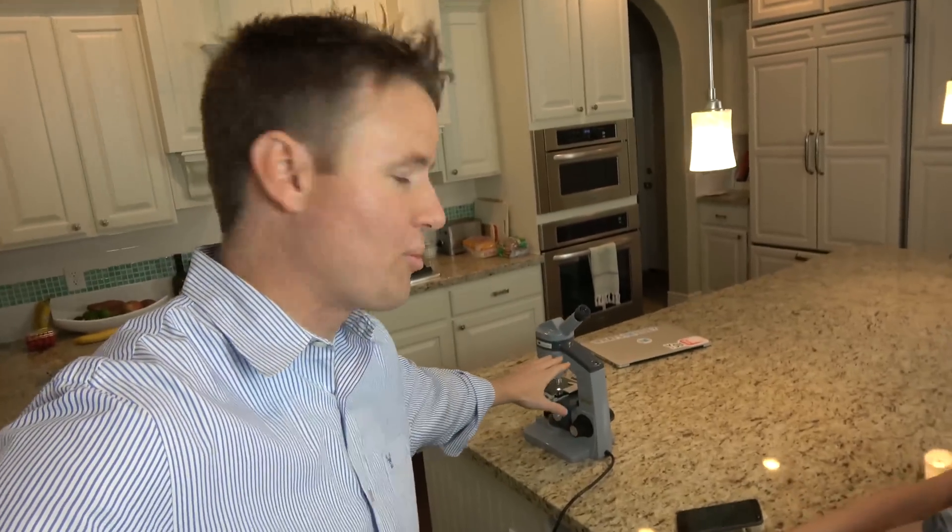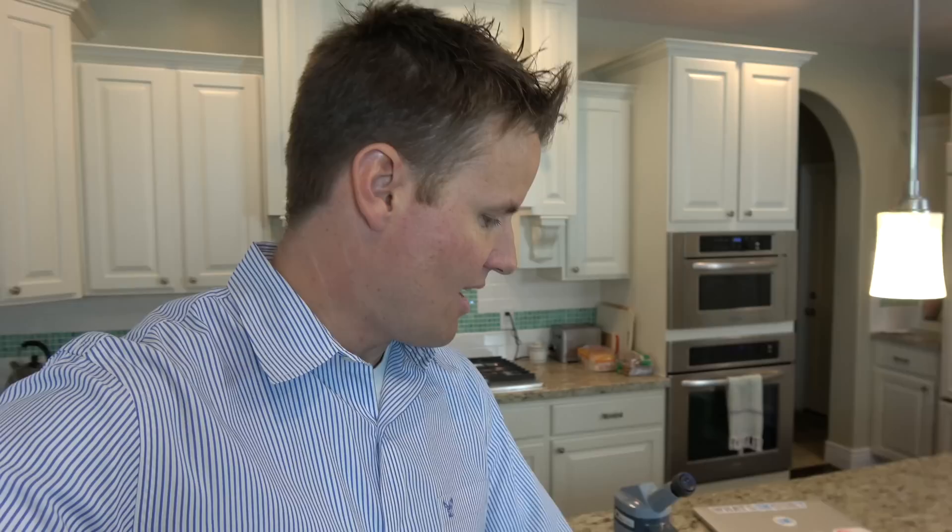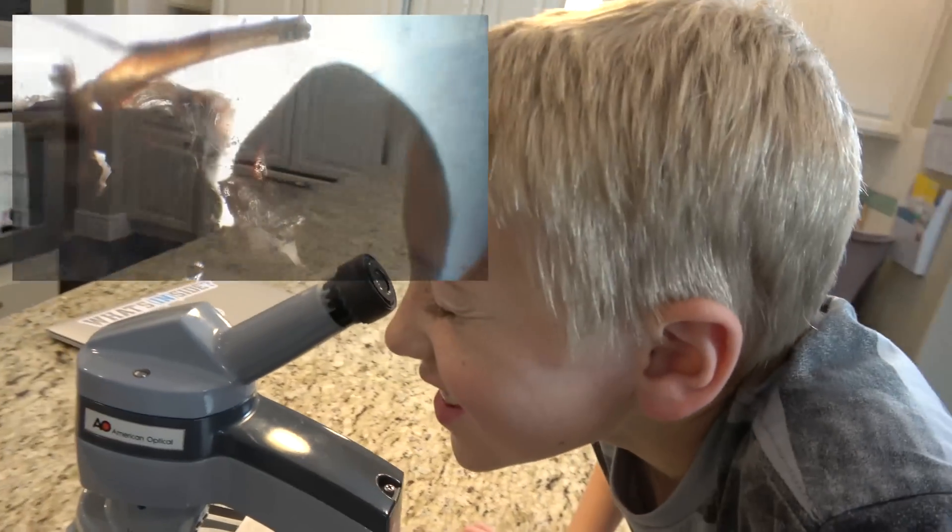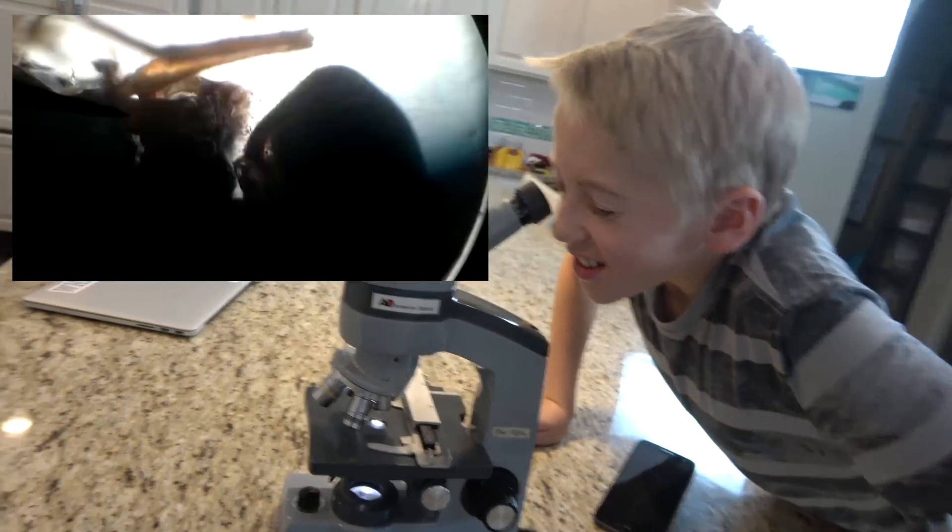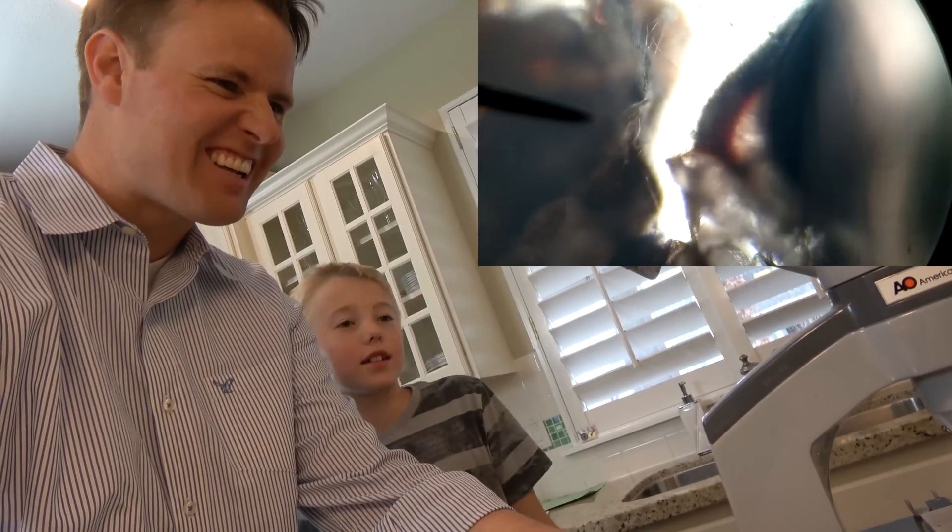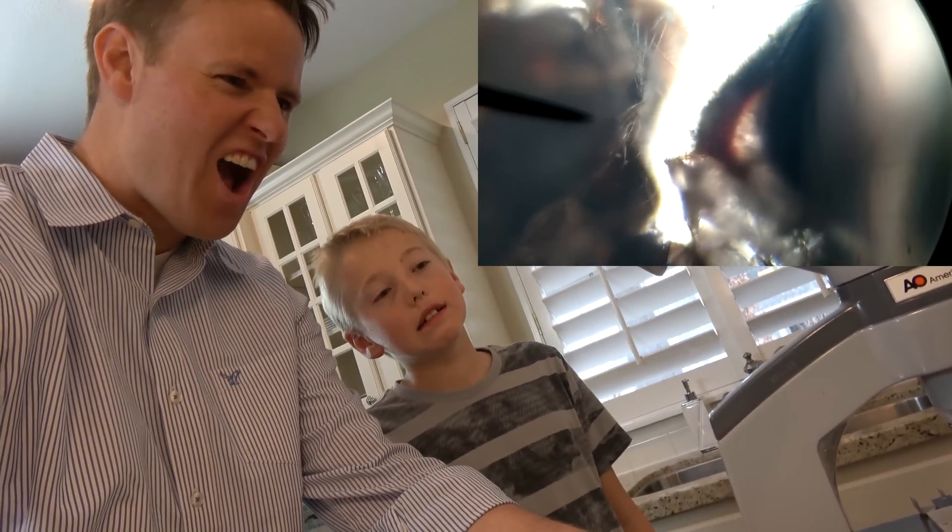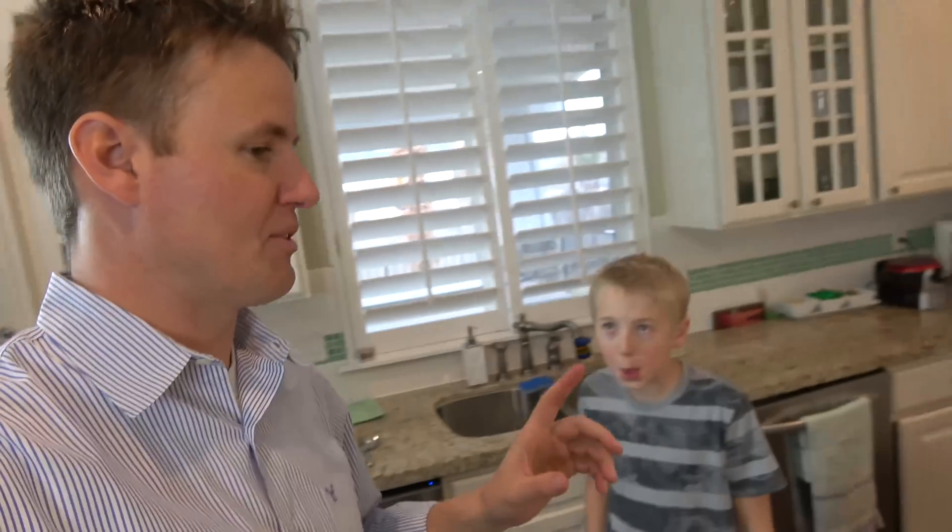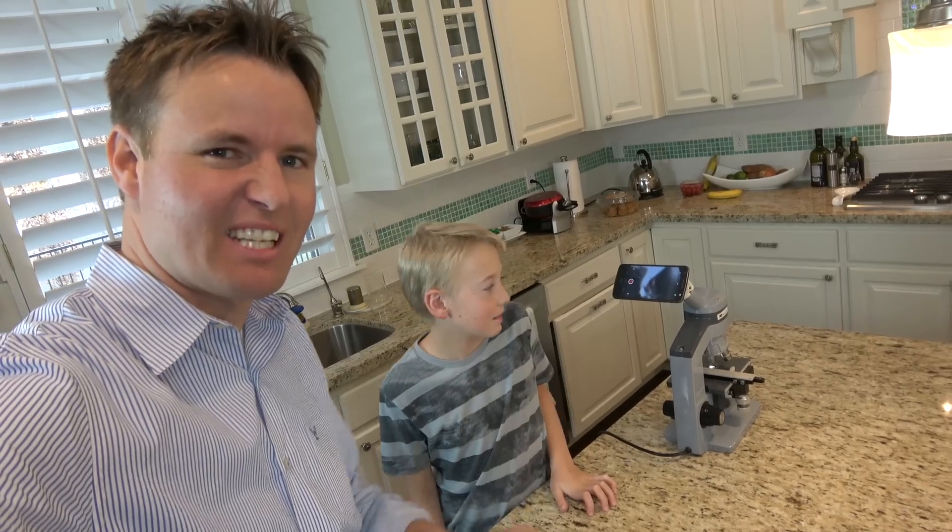We're back home now, and I wanted to make sure that this microscope works and I can show you guys it works. I bought this little adapter, this like glassed-up adapter thingy. This is what a fly looks like. It's like hairs and eyes. Oh, we have confirmed that was super gross.